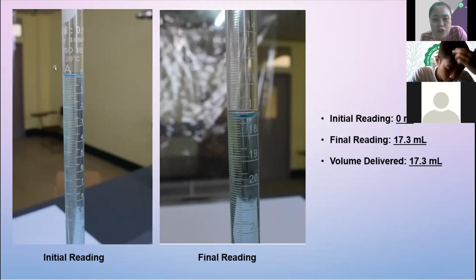This is actually used during titration. So pag titrate, nagbaba yung volume of liquid. So pagbaba niyan, yan yung measurement ng nagamit. So from 0, nakagamit tayo ng 17.3. Okay, so variable volume pa rin ng liquid yung ating mini-measure using the burette. Pero again, mostly ginagamit ito for titration.